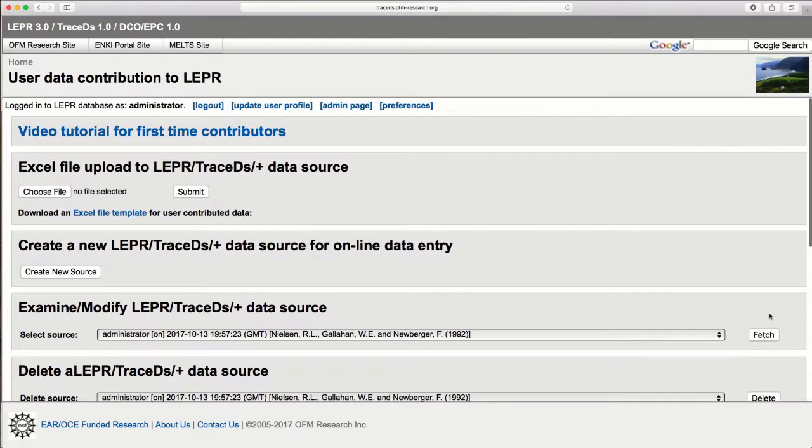That's all you need to know for uploading an Excel file into LEPR traceDs. That's it. Thank you for listening to this video.